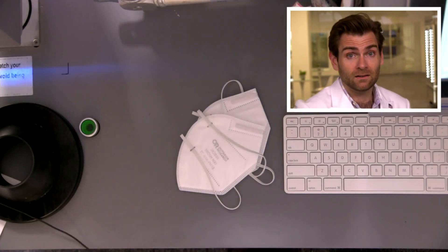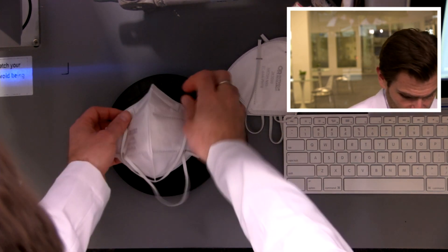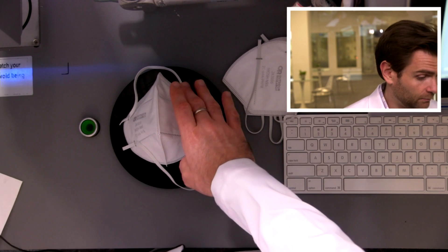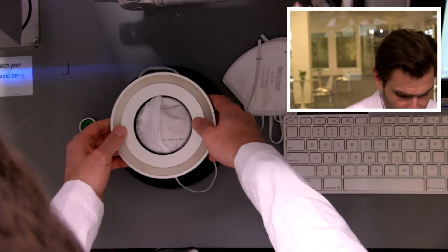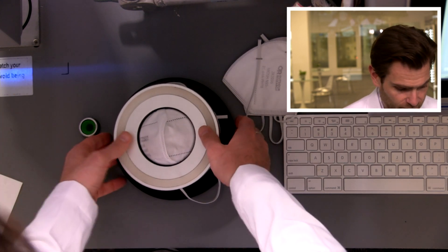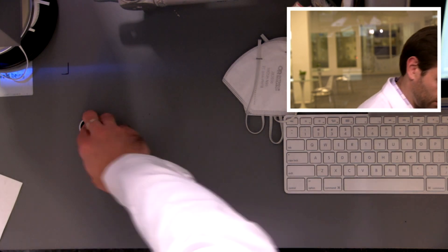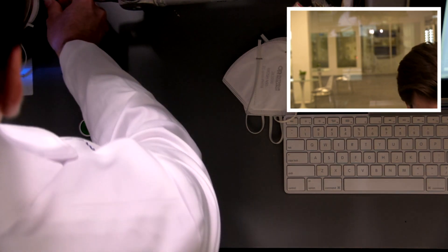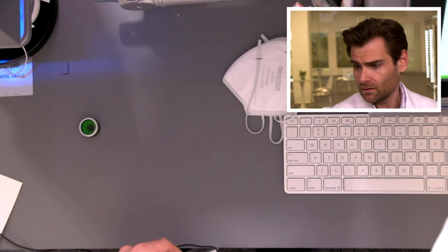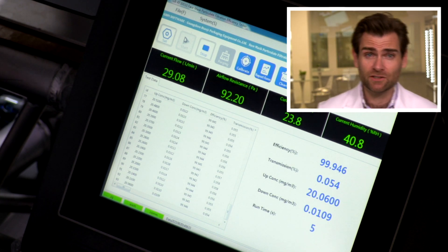Without further ado, let's put it in the clamper. My clamp cam is damaged at the moment — not sure what happened. This is a slightly different setup than before; you can check out how it differs. We are doing a slightly different test than what NIOSH would be doing, and the big difference is how it seals around the mask. Let's let it rip — this is a PFE machine, a particulate filtration efficiency machine.